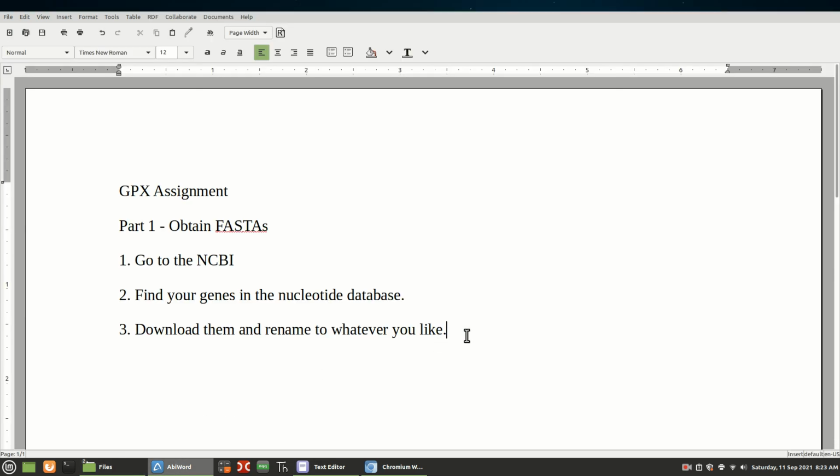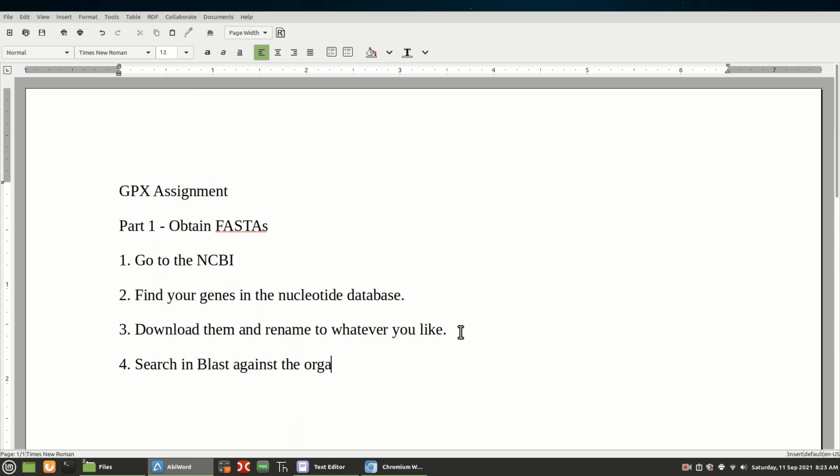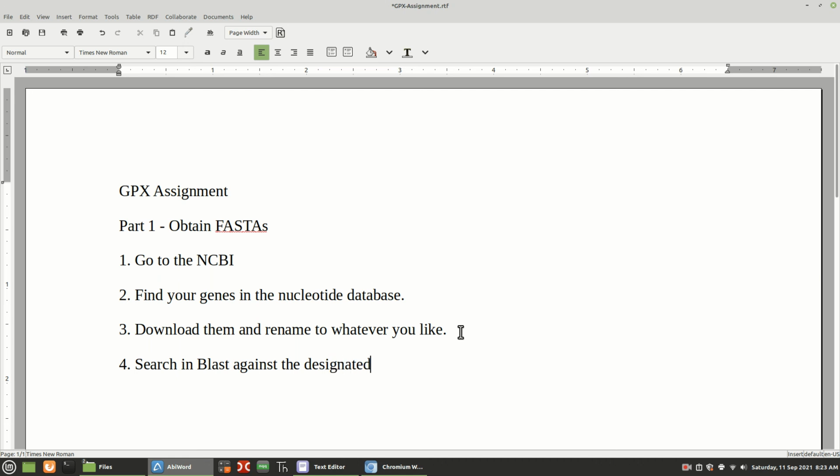So let's go back to our description here. What do we do? Download and rename to whatever you like. Search in BLAST against the organism, I'll just say the designated organism. Search using this sequence. The human sequence.